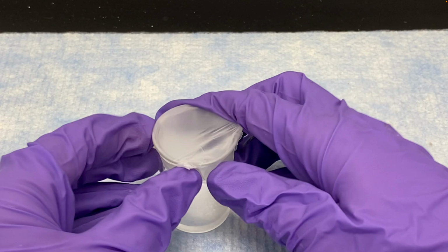But for us, we're going to stop here. At this point, you have the liquid. Just make sure when you run the IR spectrum, you don't take up any of that anhydrous sodium sulfate that's there as the solid. And so that's a guided walkthrough of the experiment for oxidizing Borneol to camphor.